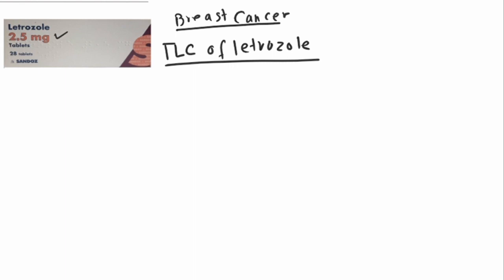Before conducting TLC or any analysis of quality control, any analysis for any medicine is split into two ways.